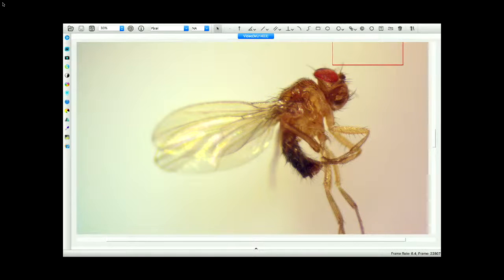And then the last thing that we want to take a look at and observe on our fruit fly is its body color. Now, this is one that can be a little bit tricky, but overall, the body color, I describe it as tan. Some people like to describe it as a yellowish brown, but we don't want to call it yellow because it's not completely yellow and it's not completely brown. So let's call it tan, somewhere in between. So what we're going to do is we're going to go back to our SMART presentation. We're going to include that on our worksheet.